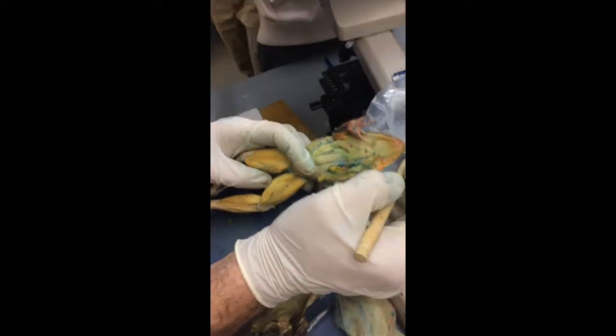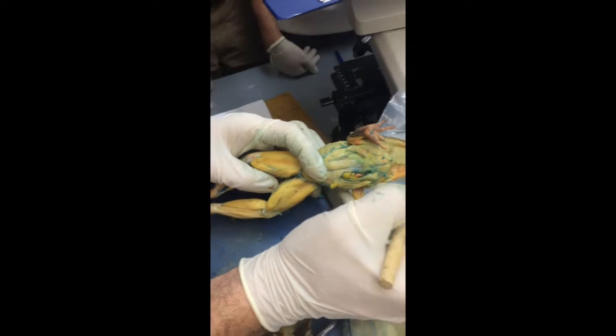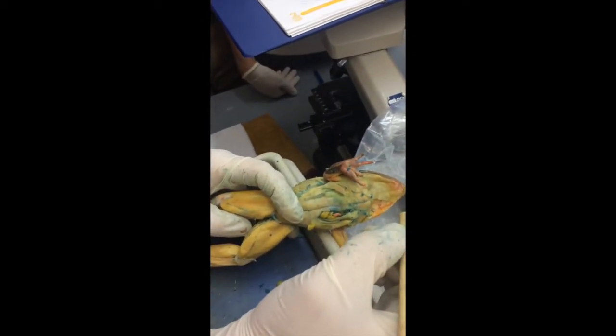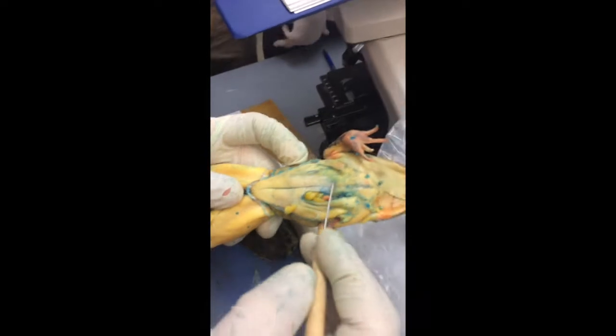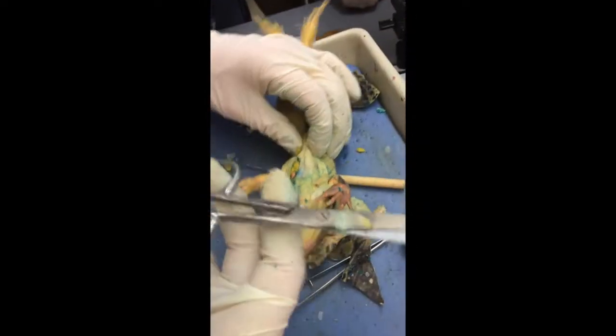You need to see the pectoralis, the triceps femoris, sartorius, gracilis major, as well as the rectus abdominis, which is this thing here. Okay? That's all you need, okay? We're gonna go inside here so you can see the internal structures now.